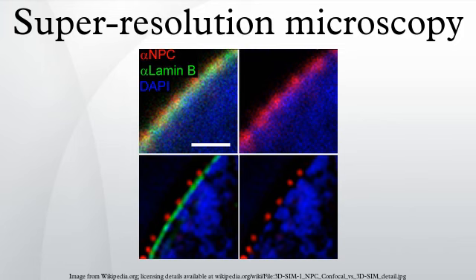For example, super resolution optical fluctuation imaging, SOFI. It is possible to circumvent the need for PSF fitting inherent in single molecule localization microscopy by directly computing the temporal autocorrelation of pixels. This technique is called super-resolution optical fluctuation imaging and has been shown to be more precise than SMLM when the density of concurrently active fluorophores is very high.